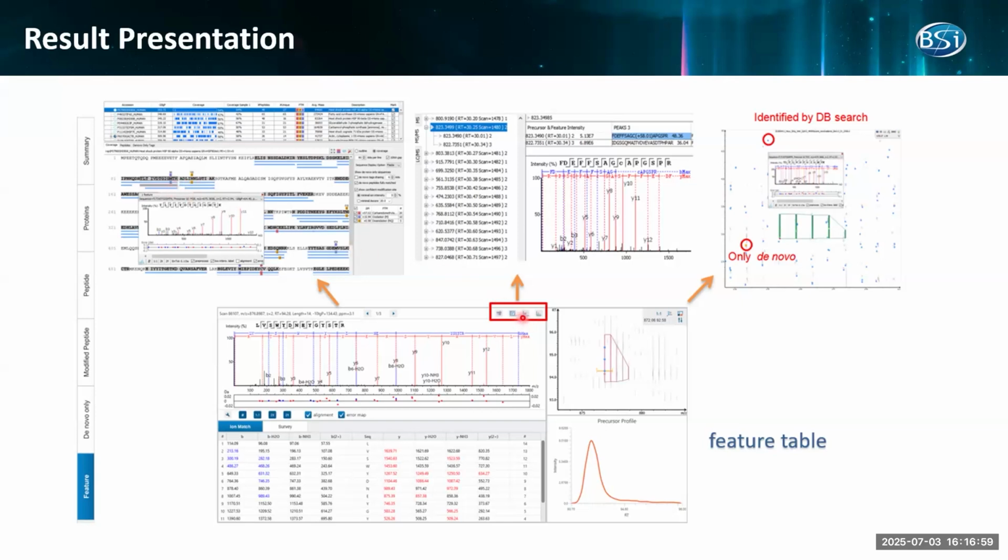If you want to check the raw data, you can go to MS2 information. In this case, you can see this is a chimeric spectrum. The instrument targeted the higher abundant precursor, however there is a chimeric precursor also co-eluted. The software will give this as a primary and secondary, chimeric spectrum.